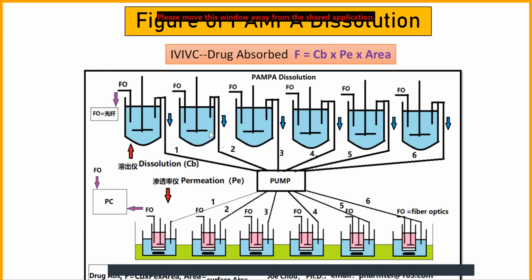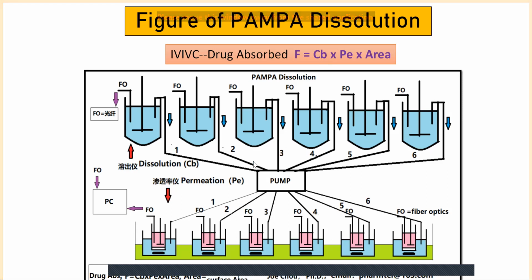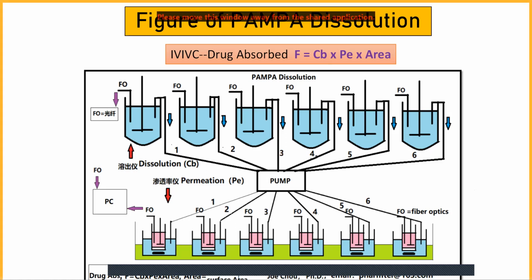They are compared in parallel, and through the program comparison you will know how good your test drug is versus the reference drug.